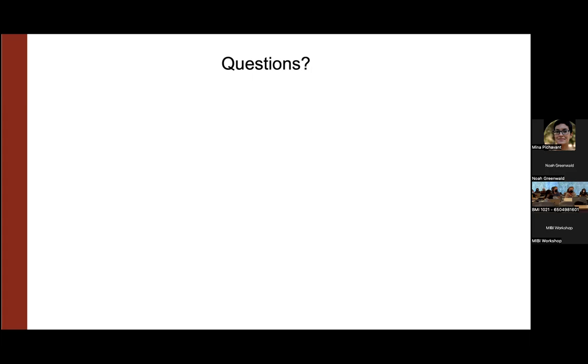We've had debates about this. There are two types of markers that you can put in your panel. It could be a marker that you just want to identify a cell type where the degree of expression doesn't really matter, like HH3 or nuclear or segmentation ones. Vimentin actually might matter. But there are markers where you don't really care about the degree of expression within a cell. You just want it to be positive or negative, so binary expression. The second is where you want to see a difference in expression levels.